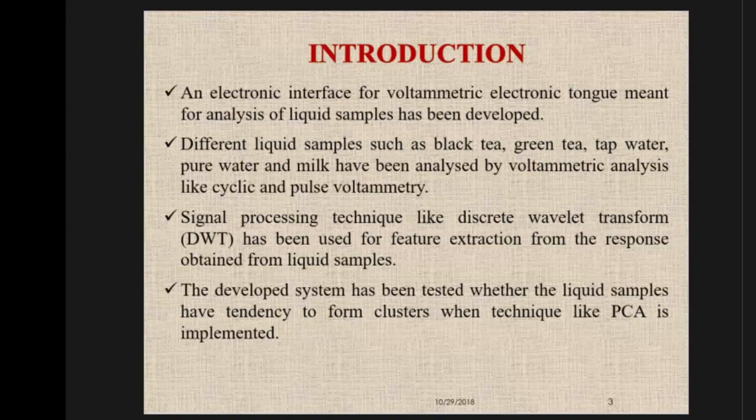Signal processing techniques like discrete wavelet transform have been used for feature extraction. Finally, principal component analysis has been used to show that the multivariate response is clearly separate from each other when the samples are changed.